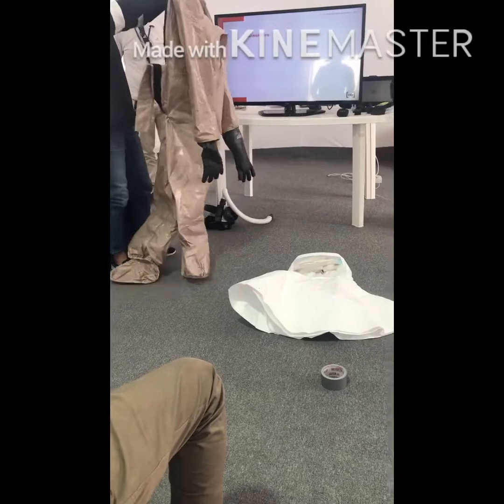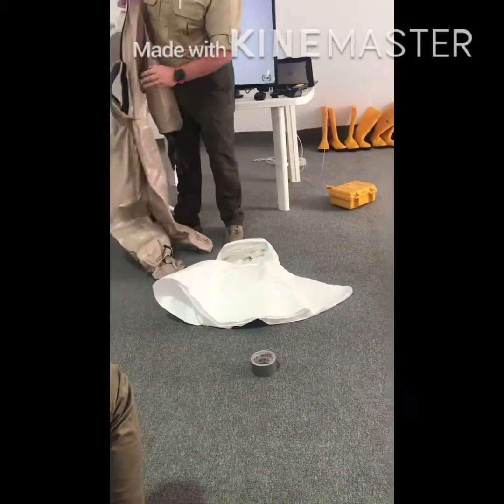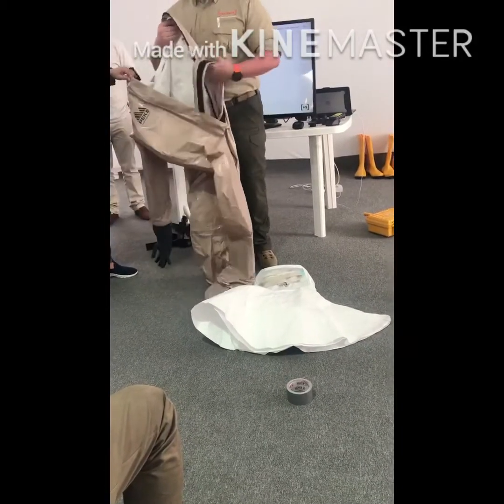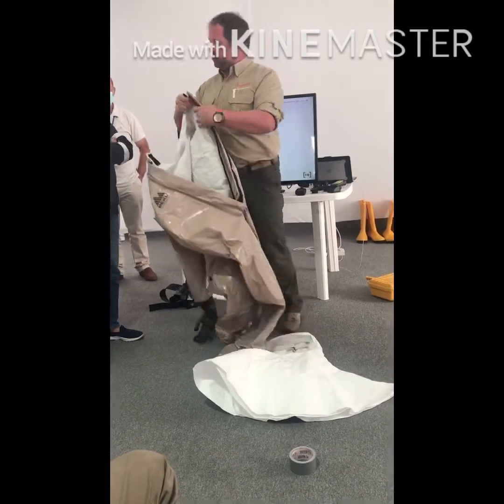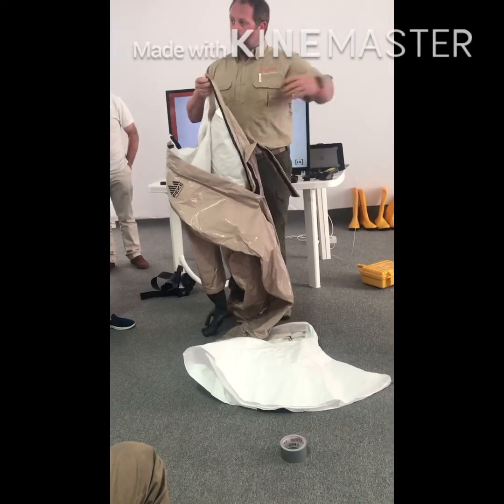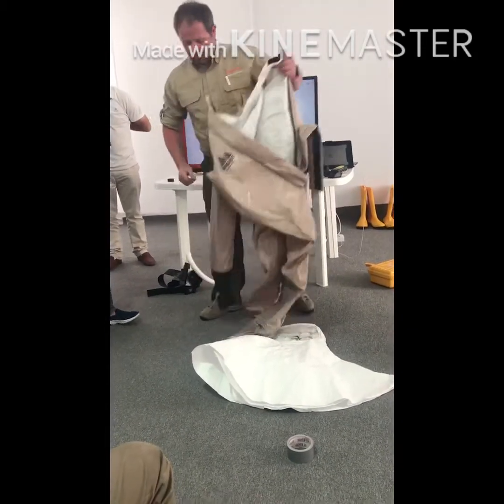Let me know when you're happy. Okay? I wouldn't be, because that suit's ripped. We're using it for training. One of the people that put it on the other day ripped it. So for this suit, this is fine. But if I open the bag and it looked like that, I'd want another suit. Everything should be sealed. Can you take a seat for me?